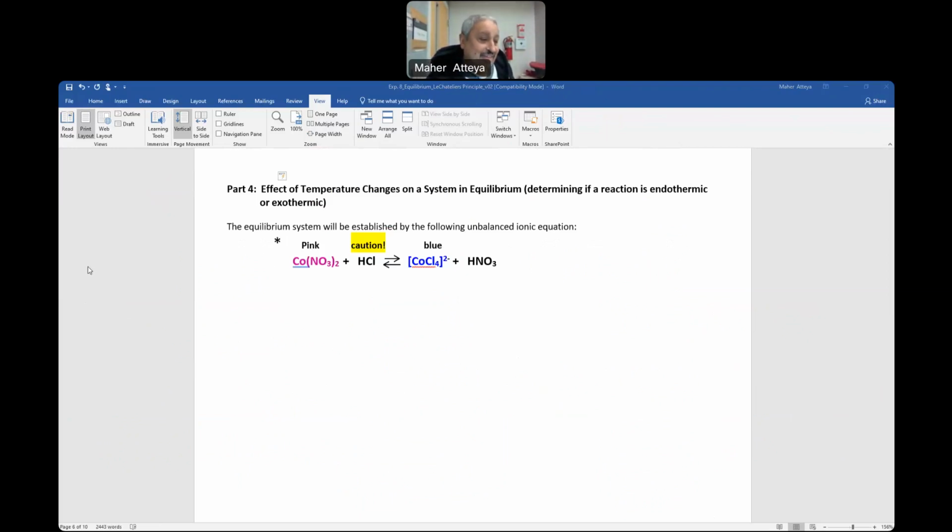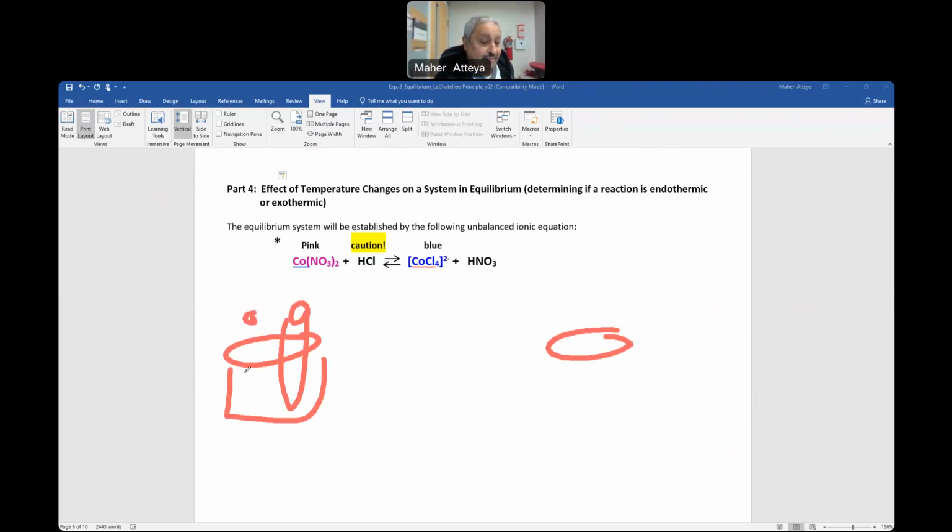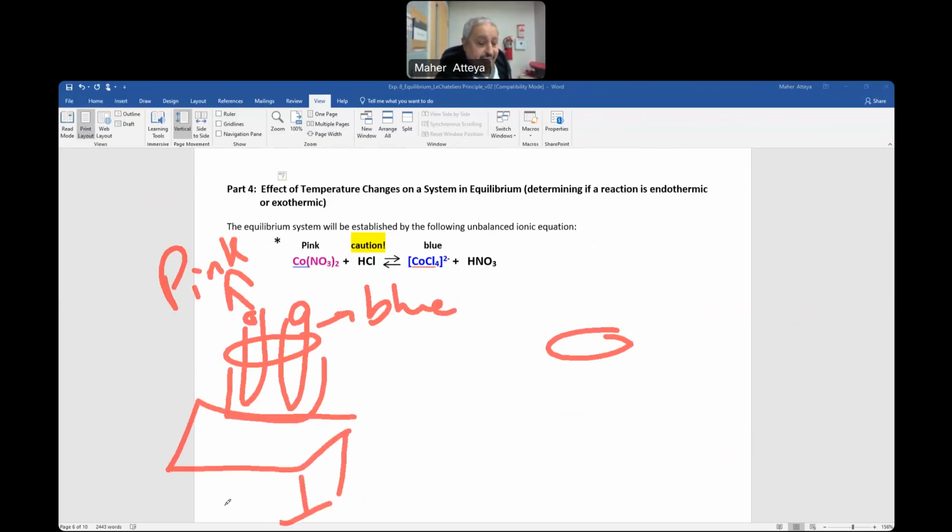But anyway, so you'll take ice. So we said here you are heating, correct? Both of them here. Okay, one is blue, one is pink, and this is the hot plate.